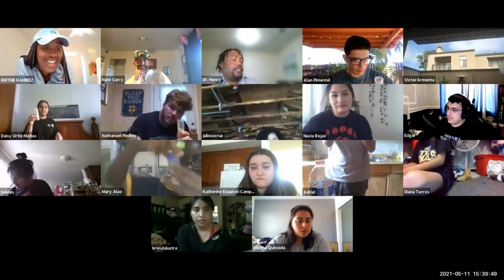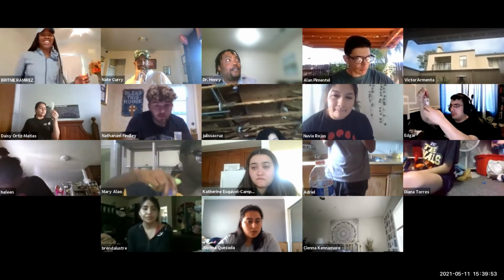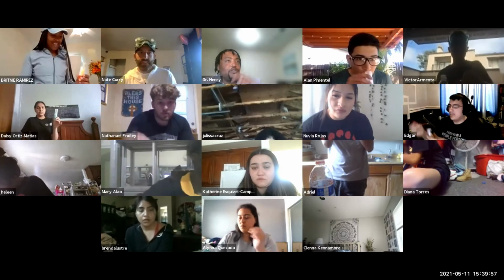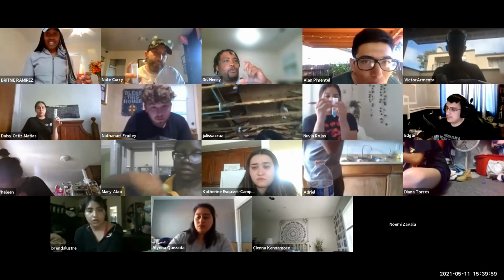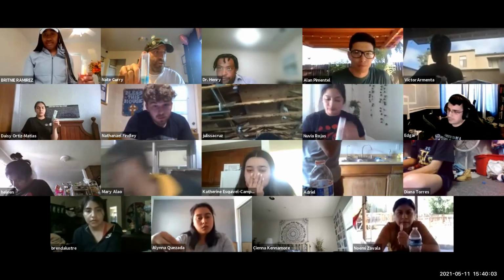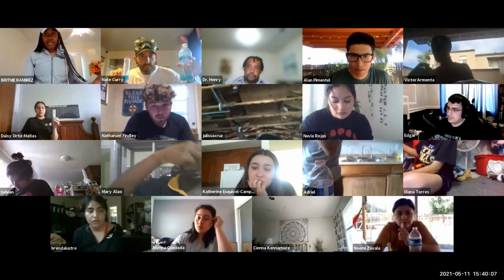Okay, so just for kicks and giggles, do a dilution. Because if it was at the top exactly, then you should be able to fall within that range. If you do the next step, it'll put you in the range where you can actually get a good measurement. So Dr. Henry, we could pour this out and pour 10 milliliters of this back in it and start over with the soap.